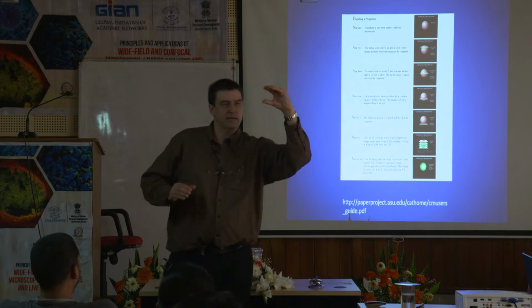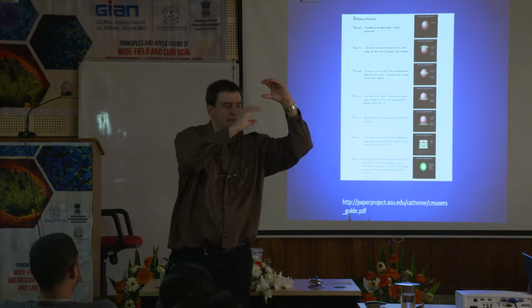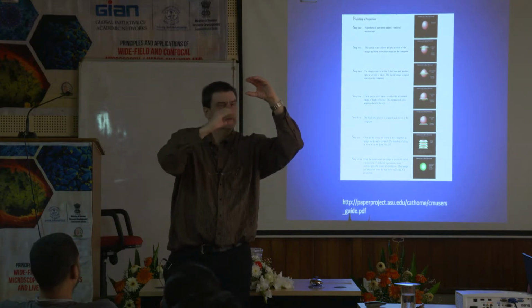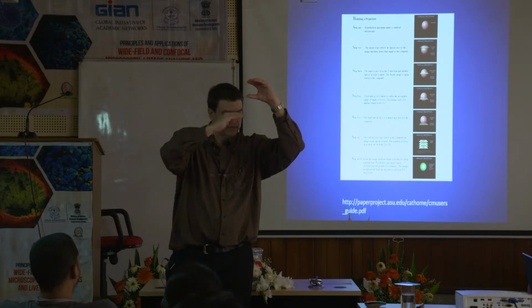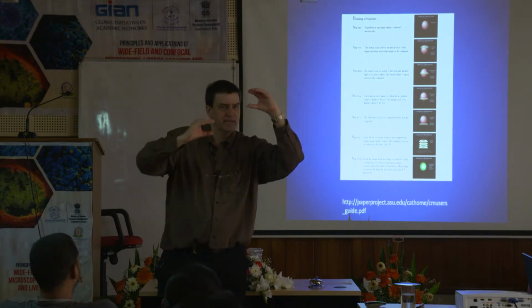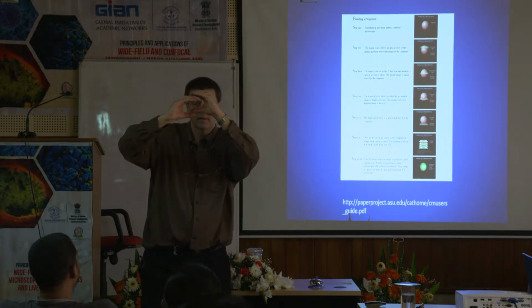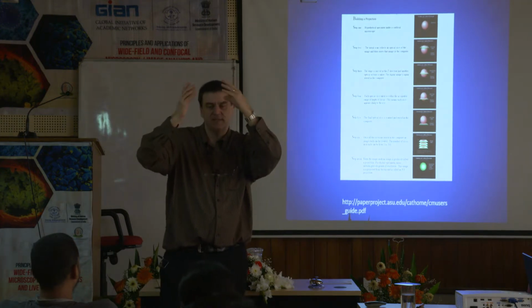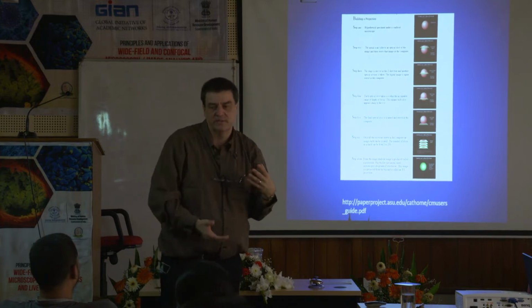Let's say you take a plane, and we'll say the plane's this thick. Now, if I took the next plane here, I would miss this. So I need some overlap in my planes so I can get a clear picture of the whole object. I need some type of overlap. But if my overlap is very, very high, almost the same, then it's too much overlap. You're almost overkill. You've generated too much information.